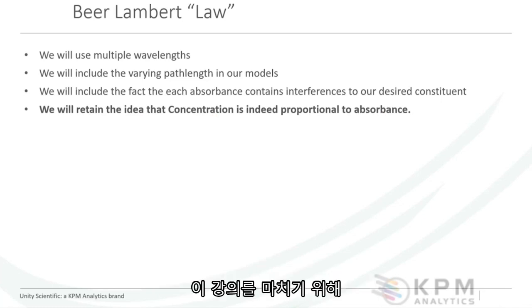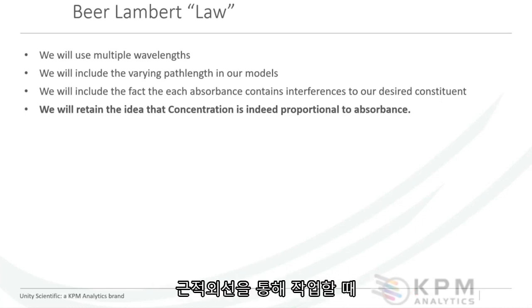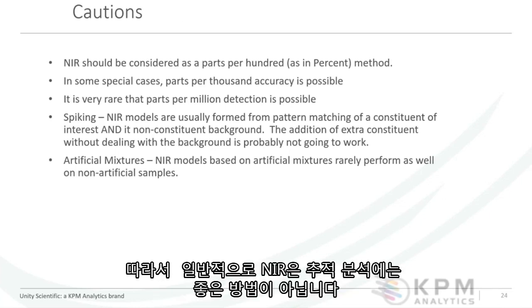One of the things I want to do to end this lecture is talk about a couple of cautions or things to keep in mind when you're working with near-infrared. The first one is that near-infrared should be considered a parts per 100 or percent method. Near-infrared in general is not a good method for trace analyses.